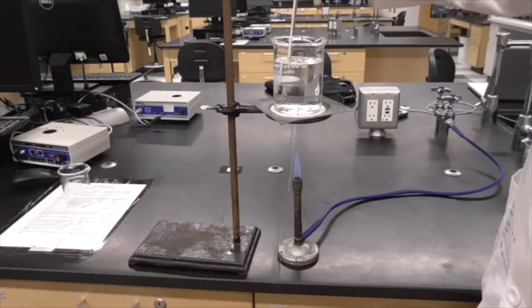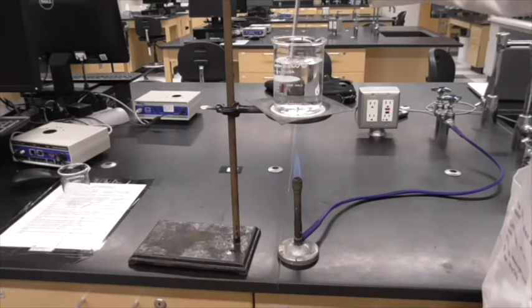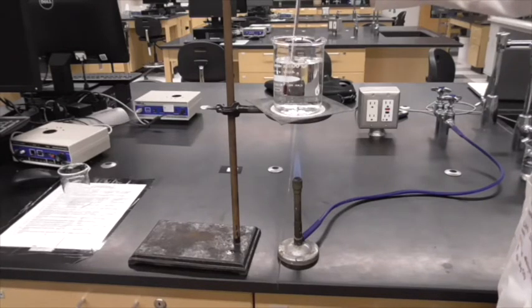So we have a little bit to go. 30. Another 10 degrees, and then we can go get our sample and get going.